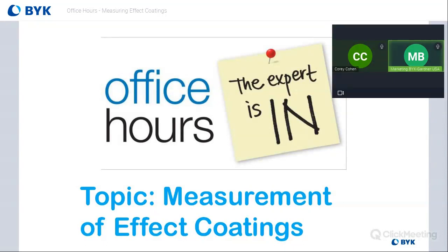So, can the instrument be used on any surface, like plastic or glass? Certainly, it can be used on plastic. If you're talking about plastic without any effect pigments in them, again, it might be simpler to turn off the additional measurement angles. You might not need those extra angles, and so the 45 degree measurement angle is recommended if you're only going to use one.